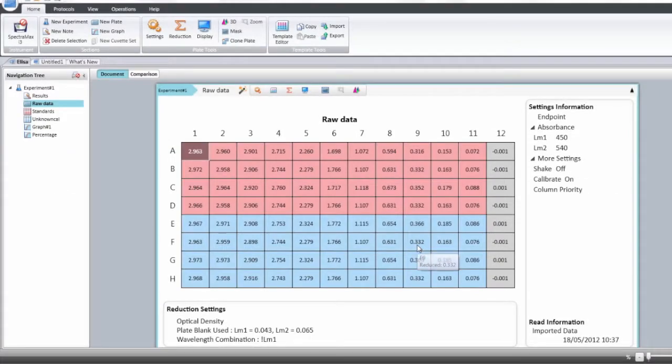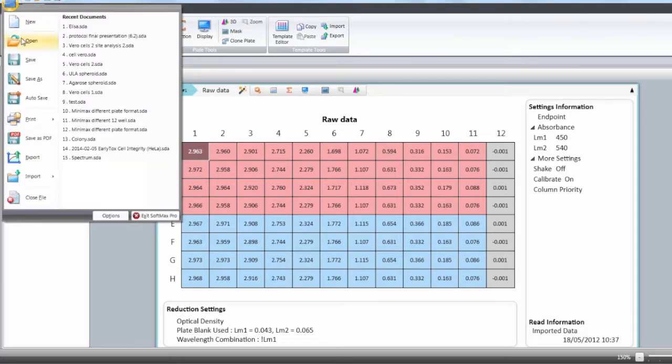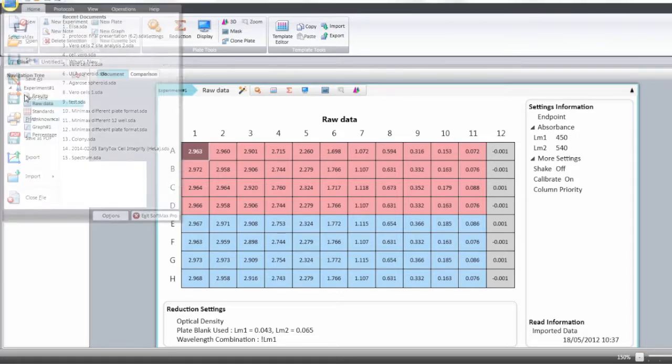In order to access the autosave, you have to go into the SoftMax Pro main menu on the top left corner of SoftMax Pro, and select autosave.